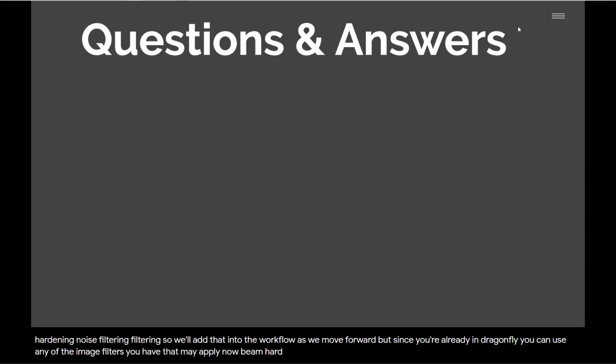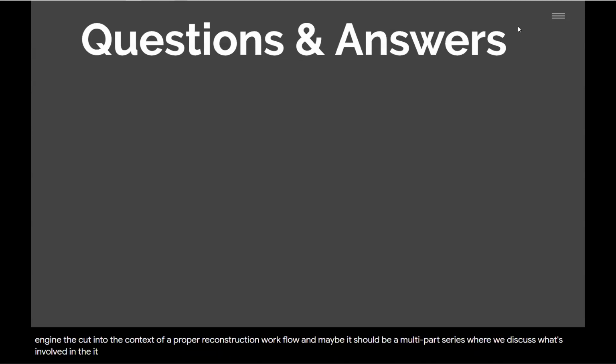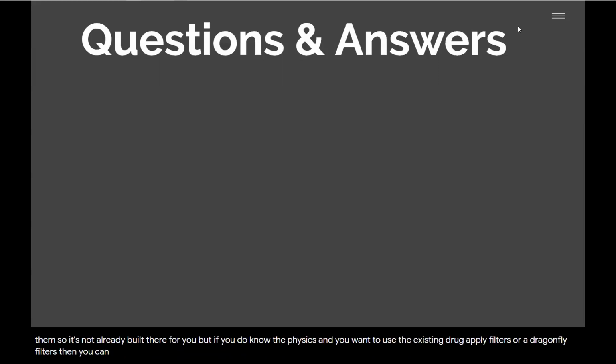Now, beam hardening is something we should build an entire webinar on, to put this reconstruction into the context of a proper reconstruction workflow, and maybe it should be a multi-part series where we discuss what's involved in the imaging physics and what the artifacts are, so you understand what the source of them is and how you should be tackling them. So it's not already built there for you, but if you do know the physics and you want to use the existing Dragonfly filters or add Dragonfly filters, then you can filter this image just like you could filter any other image stack in Dragonfly.